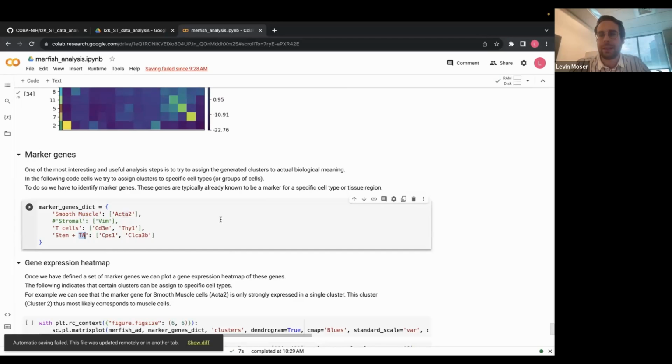And as biologists, you also know better than me that very often such cells can be characterized by a small number of genes that are very highly expressed specifically in that cell. Doesn't mean that they're not present in other cells, but they're significantly lower expressed in other cells.